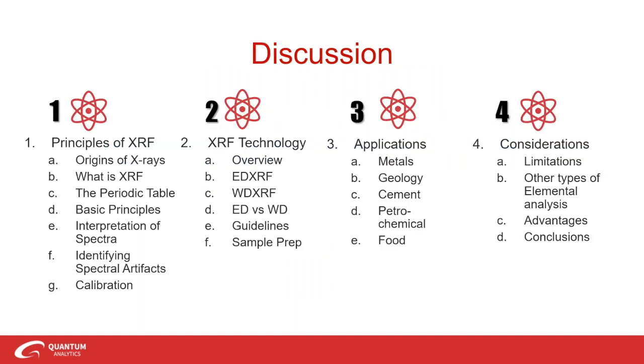Here we'll cover some basic principles about XRF. You'll learn about modern laboratory XRF technology. We'll dive into a few applications where XRF has been effective, and then conclude with some things to consider regarding XRF technology.